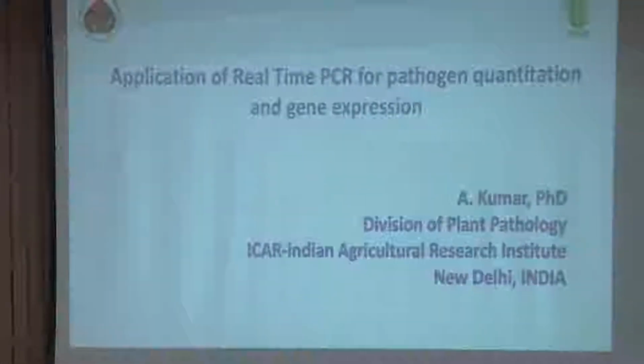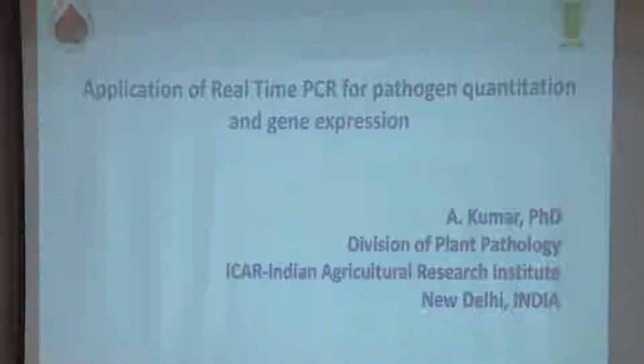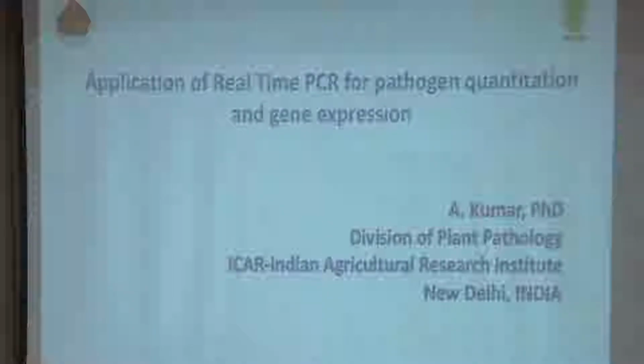We have kept one important practical this afternoon, followed by another practical. These two practicals are interlinked. Today's practical is all about isolation of RNA from microbial samples. Okay? This practical you do in the PG lab this afternoon.